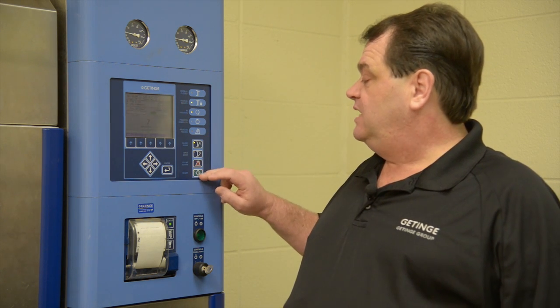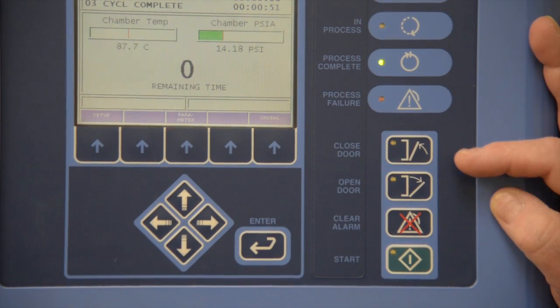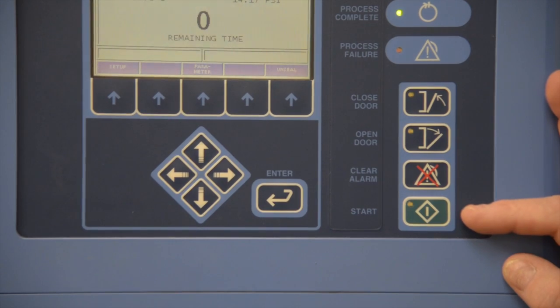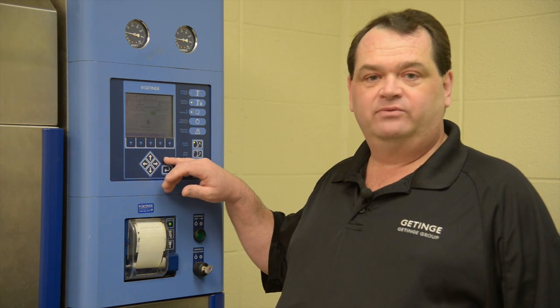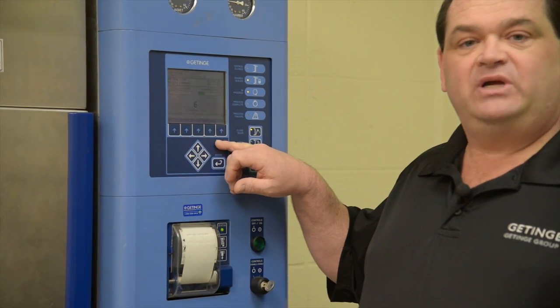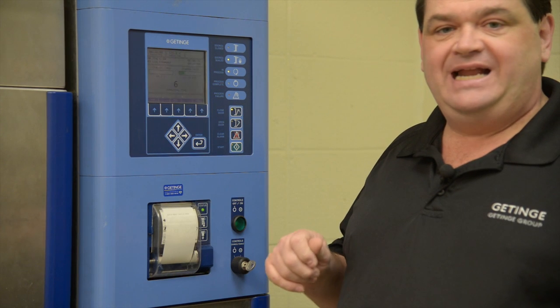We also have buttons that operate different features of the machine. The first button is the closed door button, the next is the open door, then we have clear alarm, and then we have start. The other buttons will change functions as the machine is operating. We do not allow you to make a choice that would possibly harm you during operation. You will only be able to select options that let you safely operate the machine and let you advance or abort the machine as necessary.